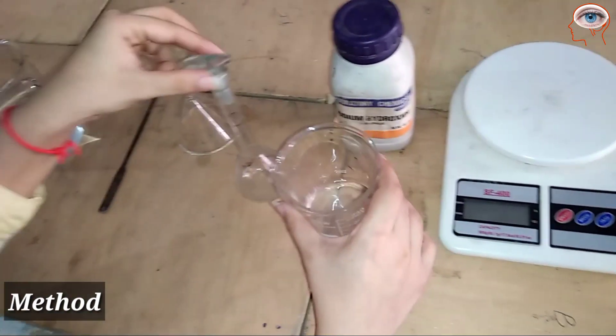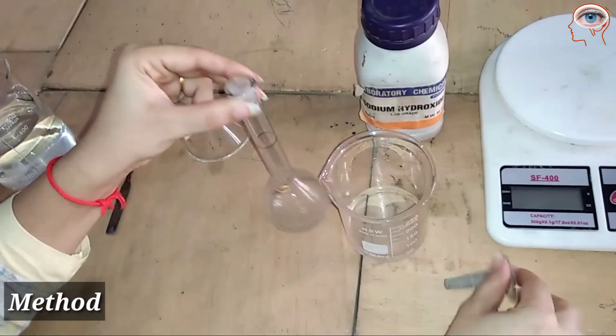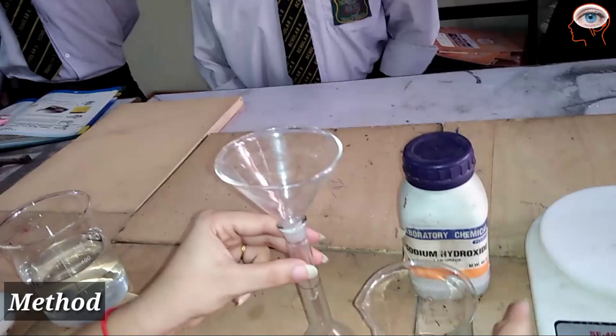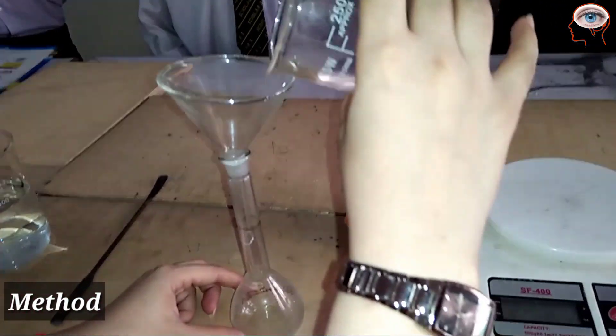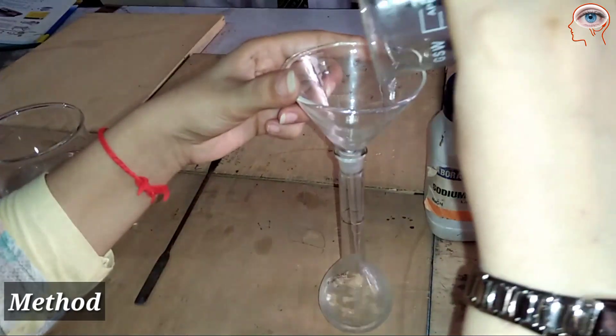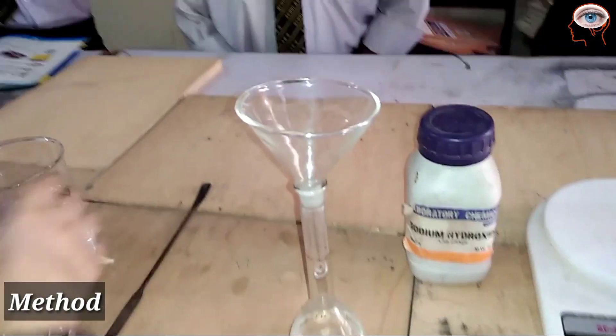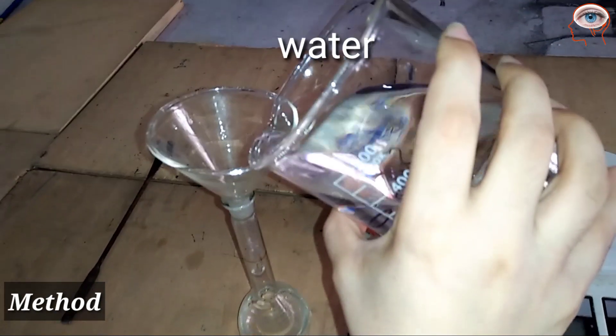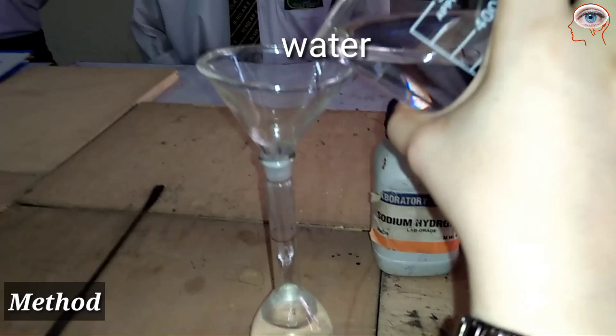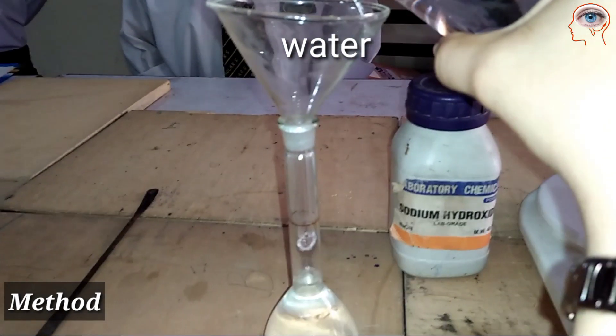When the solid is totally dissolved and nothing is left at the bottom, transfer the solution into the measuring flask using a funnel. Be careful when transferring, especially when you're very close to the neck of the flask, so add it slowly.